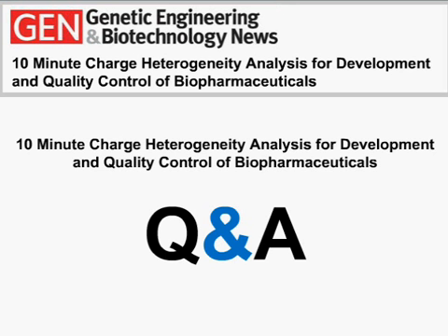Thank you very much, Scott. Carrie, a question for you. What kind of autosampler has been used in this study for quantifying concentration? We've actually used two different autosamplers. One was the system with the Prince autosampler, and we also had another system which had a 96-well plate. So we were able to use both systems, and in large part it depended on the number of samples we were receiving.